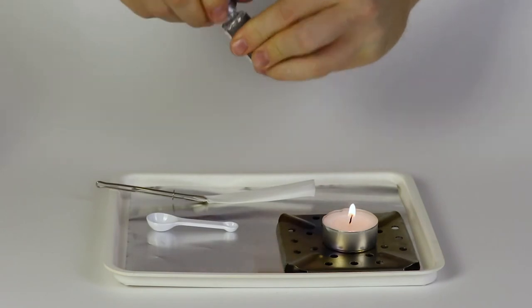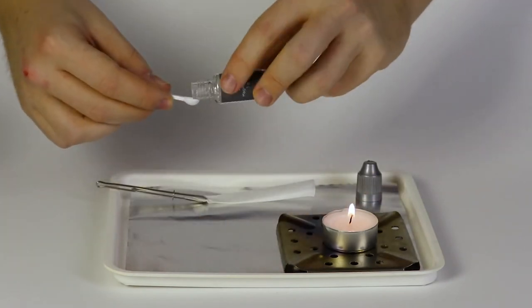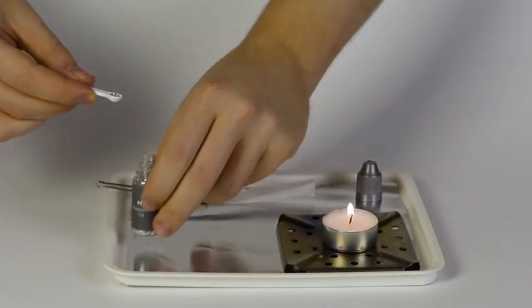Pour one small spoonful of magnesium into the fold of the paper. Spread it all over its length.